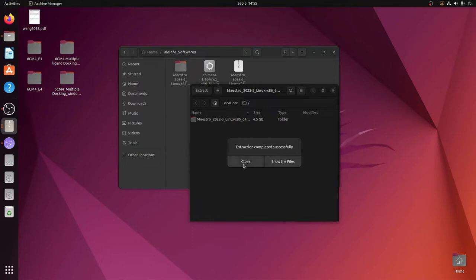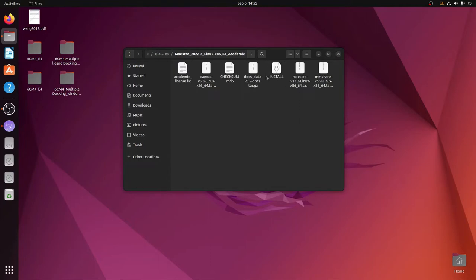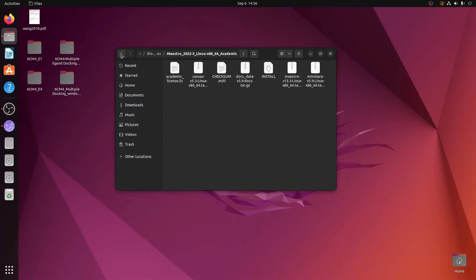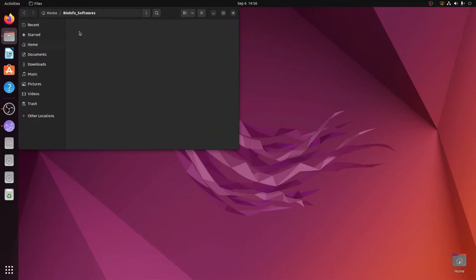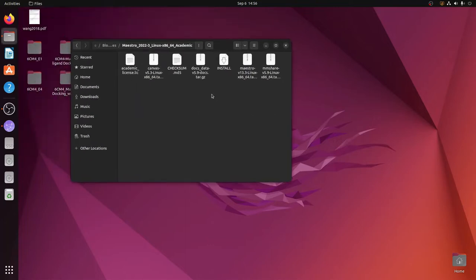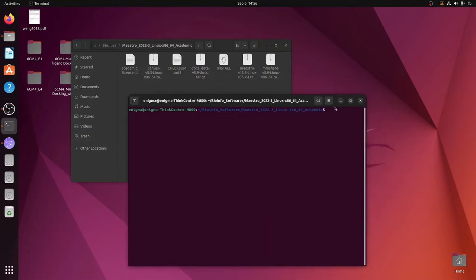We will close everything and look into the folder where all our files were extracted. We then need to run the installation file which is in there. To run this file we have to open a terminal exactly inside this folder. Go to Files, open 'bio_info_softwares', then open the Maestro folder. In the empty space, right-click and choose the second-last option which says 'Open in Terminal'. A terminal will open exactly in the folder where we extracted our files.